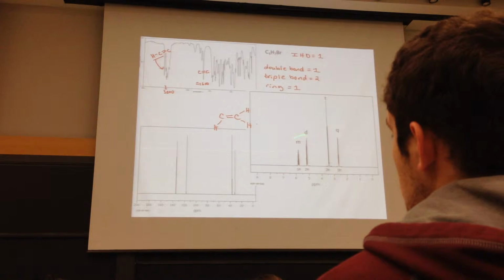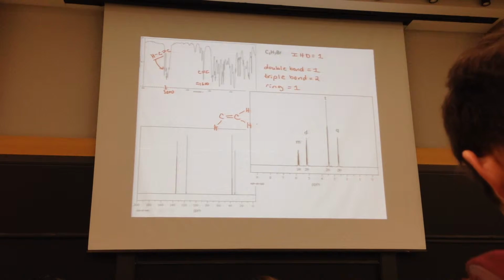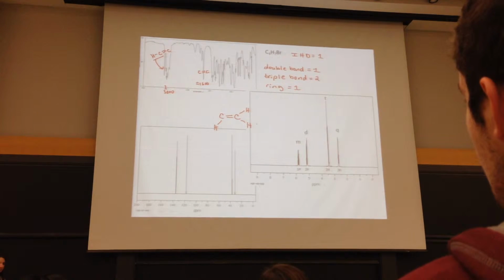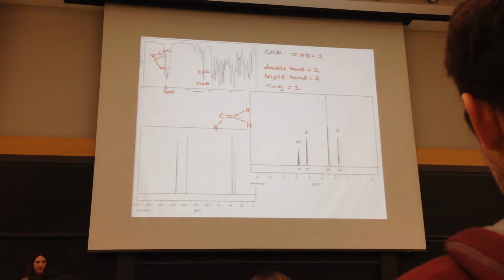In this one, my M is standing for a multiplet. This is usually more complex splittings that I don't expect you to know. But we also have a doublet. The doublet, we know is representing the CH2. These come as a doublet because the carbon next to it only has 1 proton. That we already knew though.